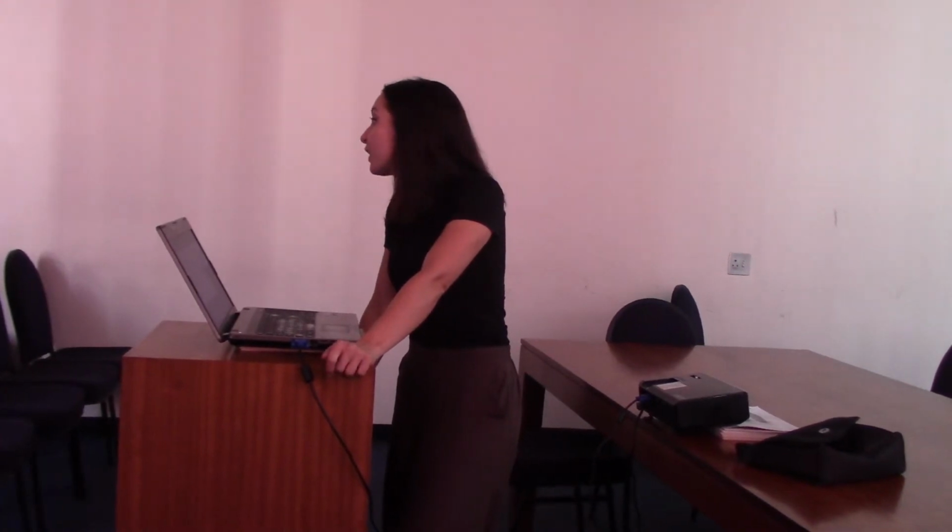I think it's still quite tricky to do a single-cell RNA-seq experiment, but you can get quite a lot of information out of it. Quite a lot of people are starting to do it, and the analysis for it also has its own pros and cons. So if you are designing a new experiment, think about the fact that bulk sequencing also has biases in it, and you may want to look at single cells if you're looking at a specific pathway.